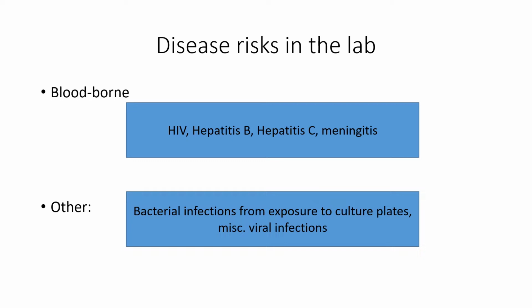Other disease risks in the laboratory would be bacterial infections from exposure to culture plates. We want to be very mindful of working with growing cultures. Also, you have to be very mindful of working with any type of viral cultures as well.